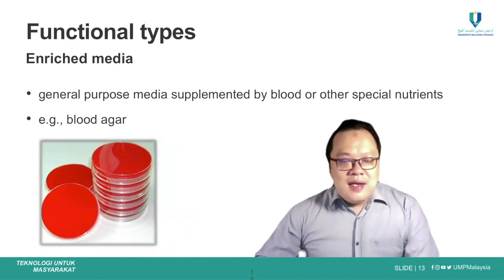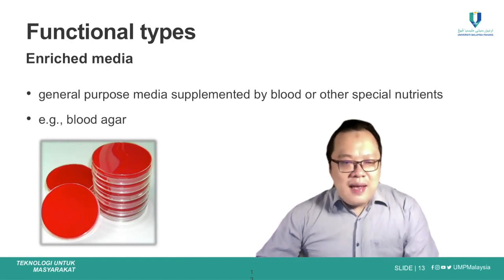Extra notes that you may take: not all bacteria or fungi can be grown on the nutrient culture media that we have in the microbiology lab.